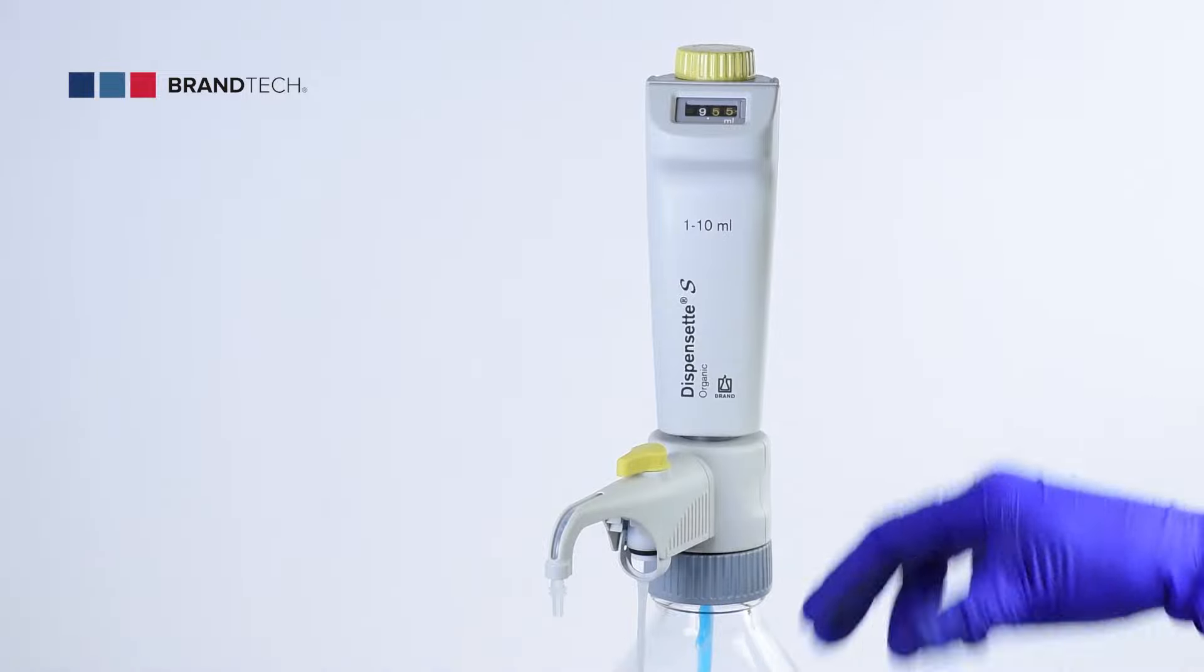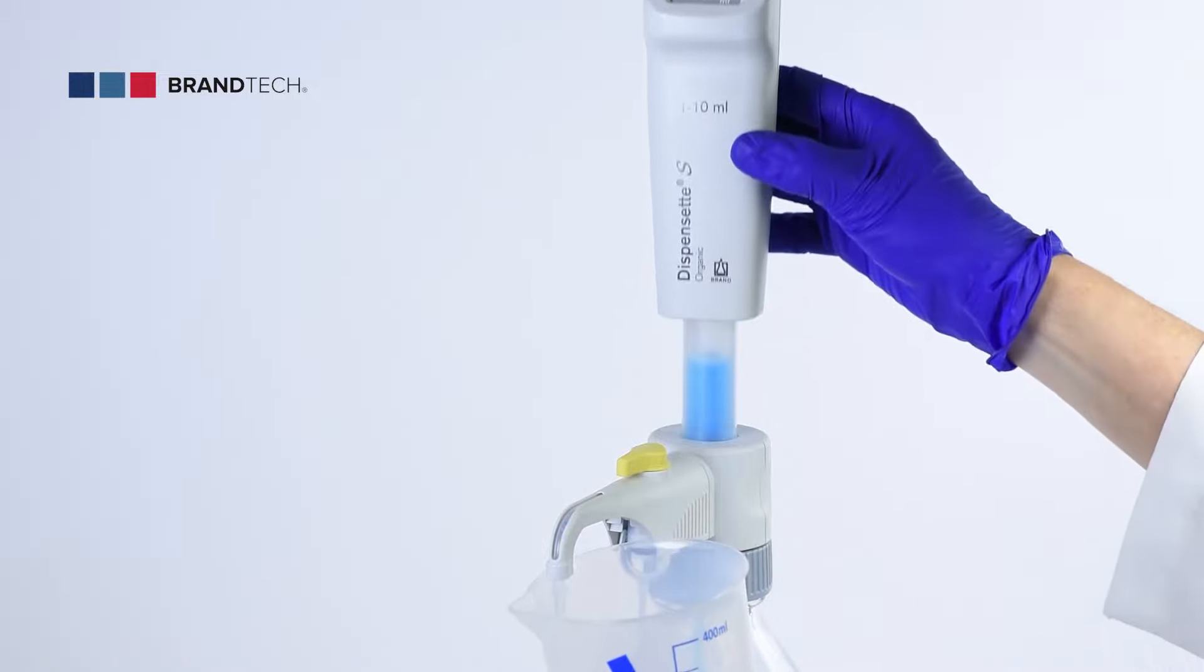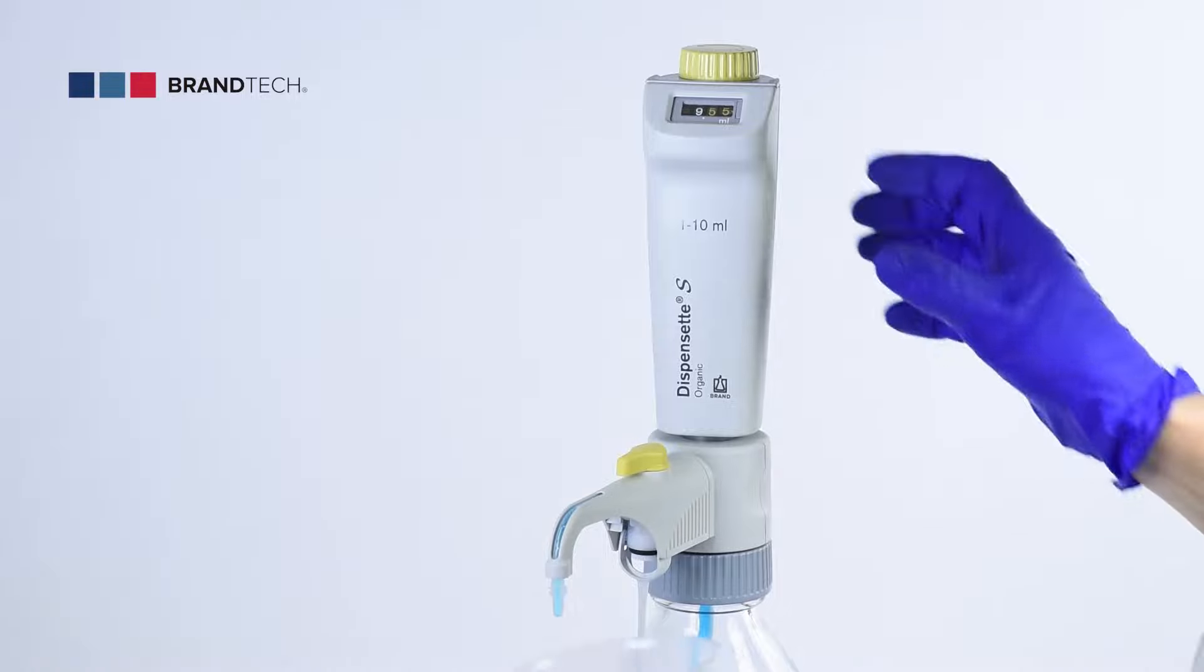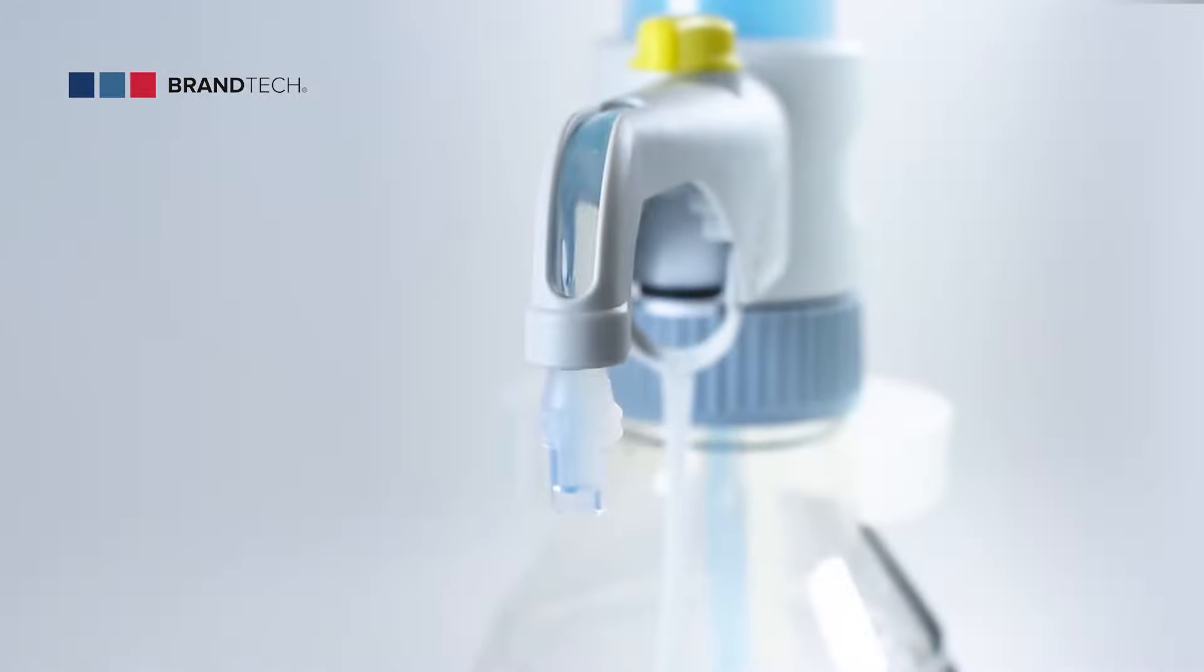Rotate the recirculation valve to dispense. To avoid splashing, hold the discharge tube against the inner wall of a suitable waste vessel and dispense. Discard the first dispensing. Make sure no bubbles appear in the viewing window on the discharge tube.